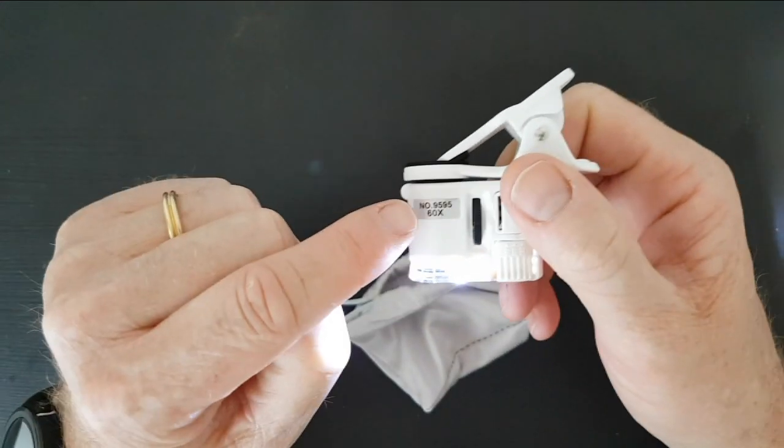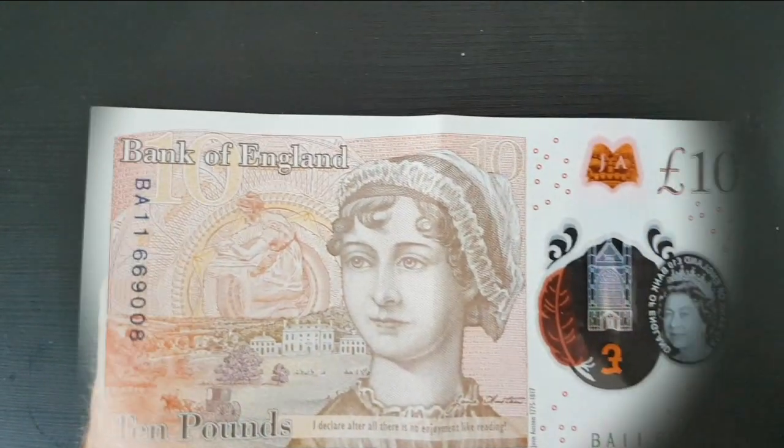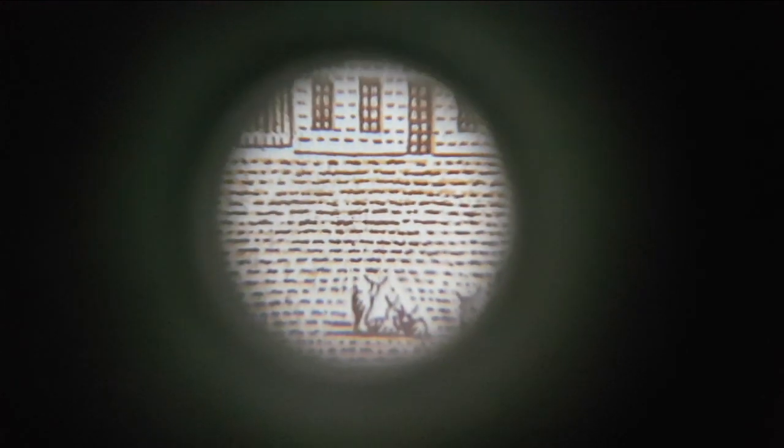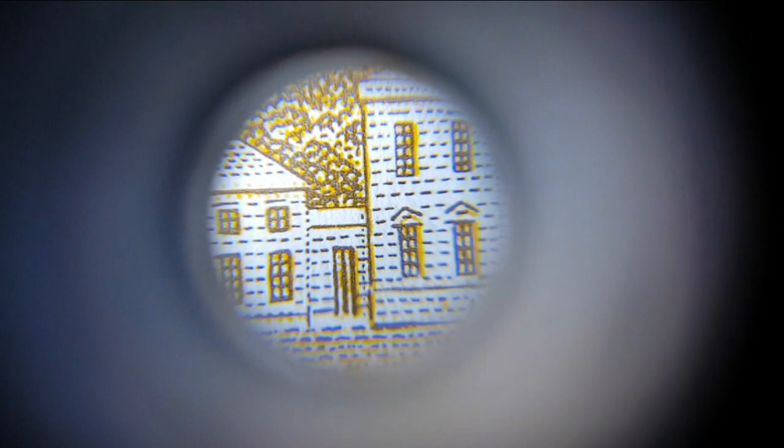It claims to be times 60 — let's check that out. First, let's have a look at the micro-printing on a tenner. There appear to be little animals down in the corner. Yeah, definitely not times 60 though. Let's try it with the light on and then the light off to see if there's a difference. The white light is giving colors that are more true to life. There's a quote here: 'I declare after all there's no enjoyment like reading.'